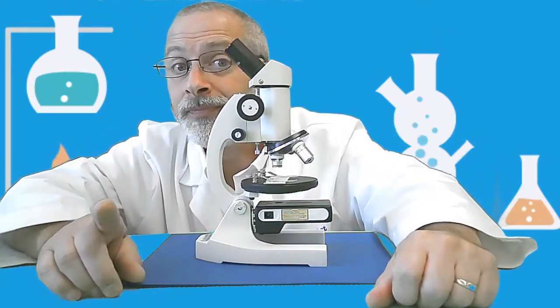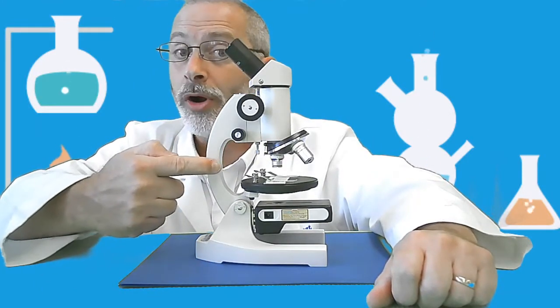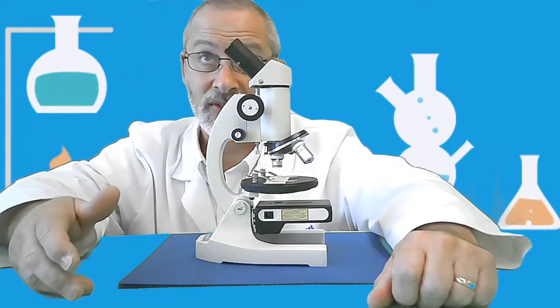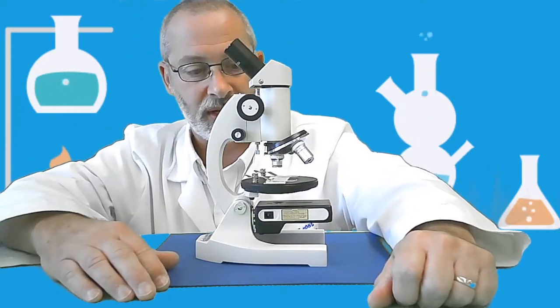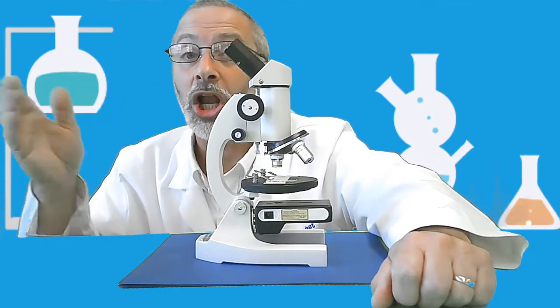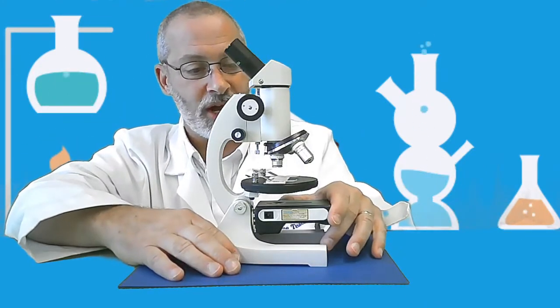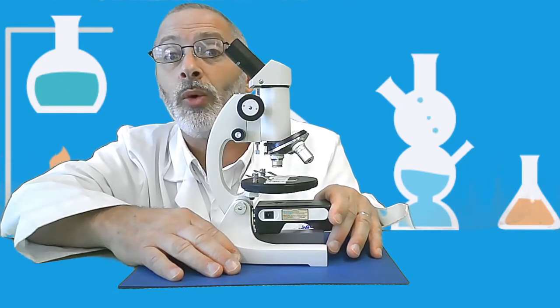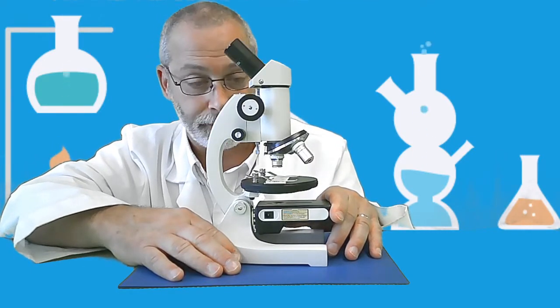Now remember, when it's on low power, what kind of light should you have? High intensity light or low intensity light? Low power, low light. So I've adjusted the lamp and it's on low power, low intensity illumination.